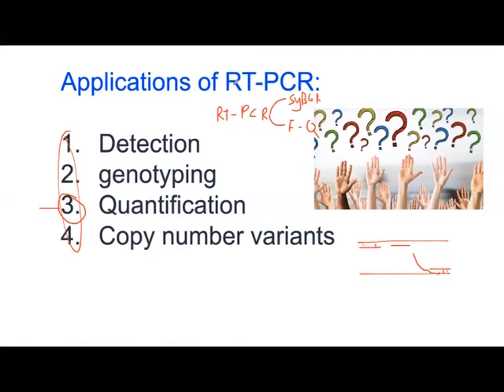RNA needs to be frozen, and that will help the quality. Some people add RNase inhibitors to keep the RNA at room temperature longer. So if you work with patients, or you're working in the field with animals, collecting blood for an RNA experiment, I advise you to add an RNase inhibitor during the blood or tissue collection. That will help keep the RNA at +4, like if you put it on ice before you bring it to the freezer.